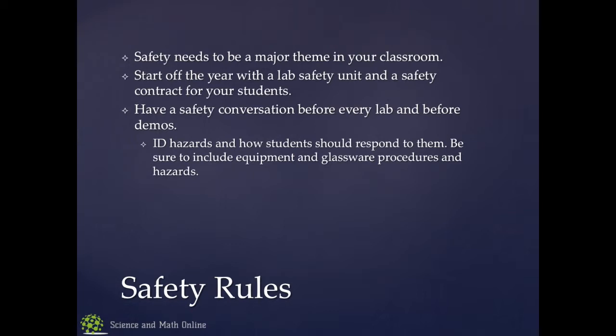It's pretty simple, but I leave it to me to know how to do it. So I tell them how to respond, which is to let me know. If they break glassware, they let me know, and that's important. You must also communicate with them how to do disposal and cleanup. Hey, these chemicals from this reaction go in this container, these go in this container.